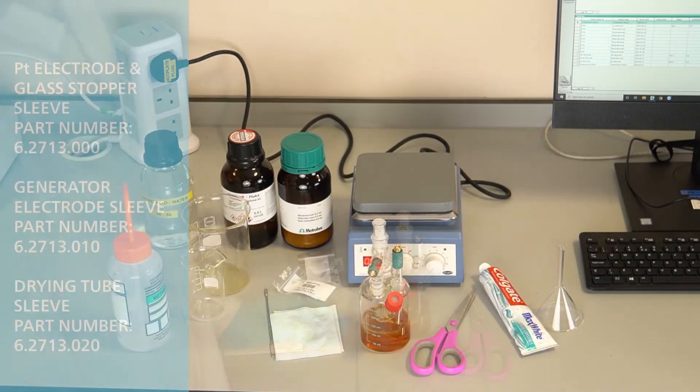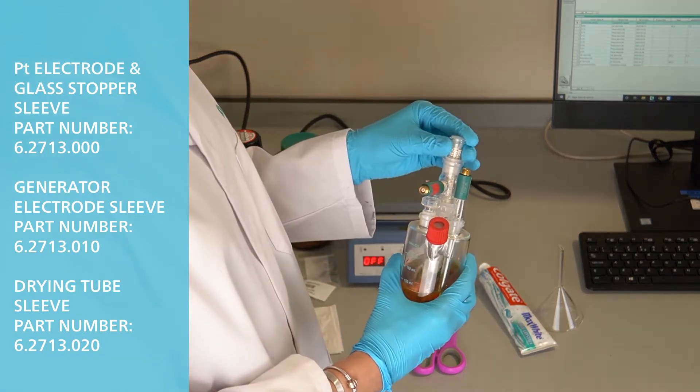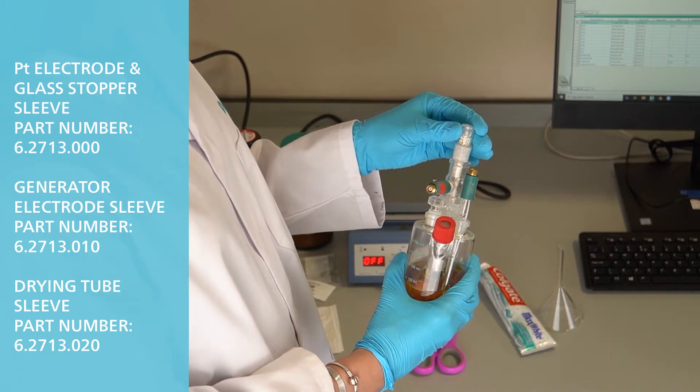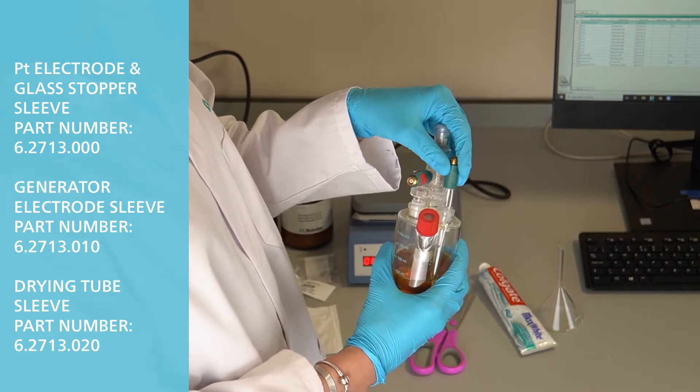Ensure PTFE sleeves are present on all glass joints and replace any deformed sleeves. Please make sure you do not use any grease.